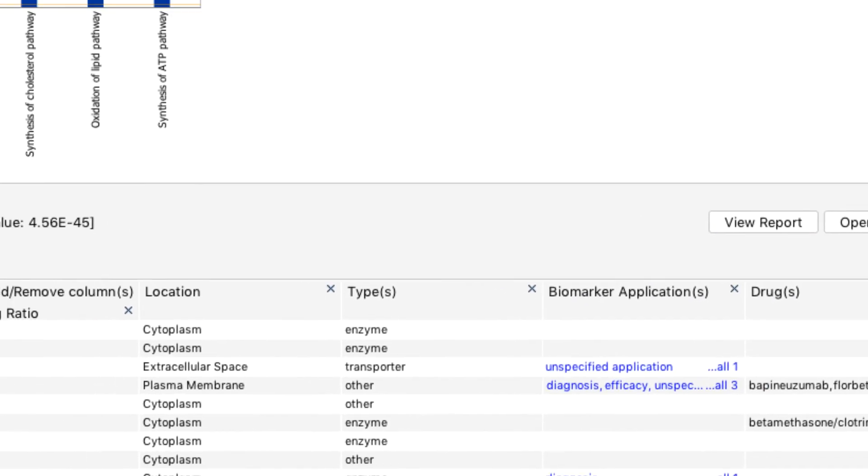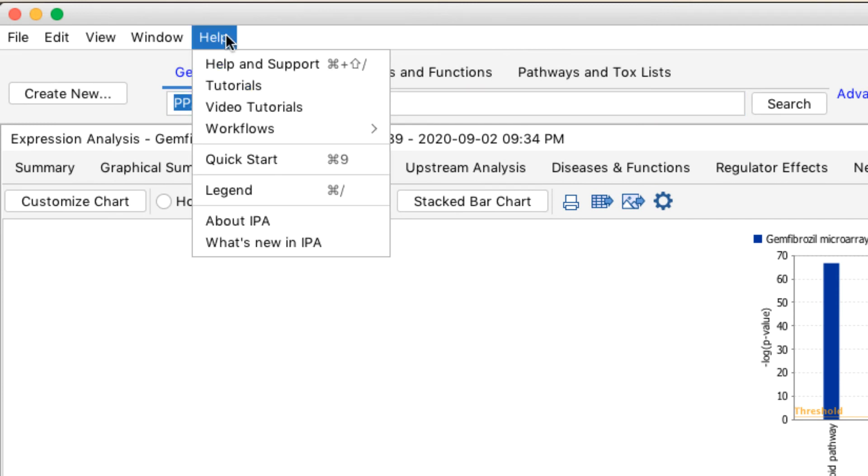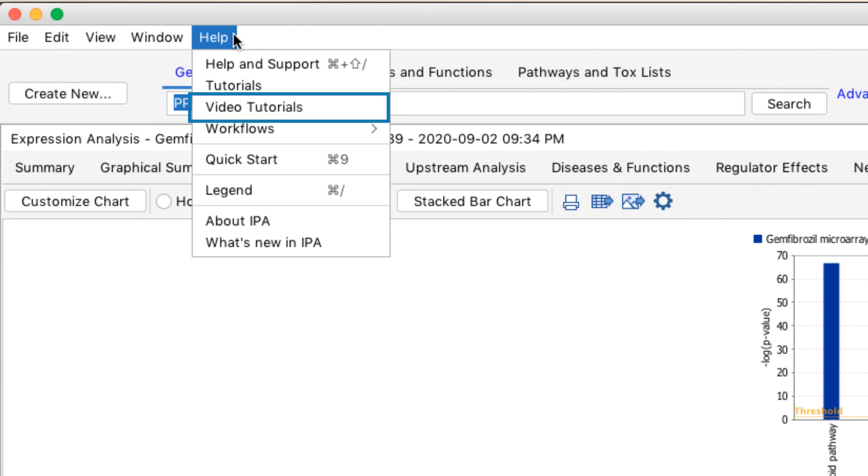For more information about MyPathway results, you can go to the Help menu to access our online help manual, or watch our video tutorials and webinars.